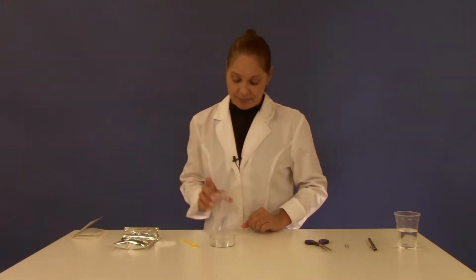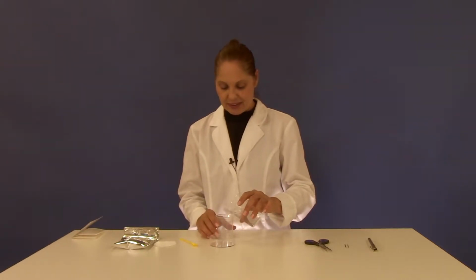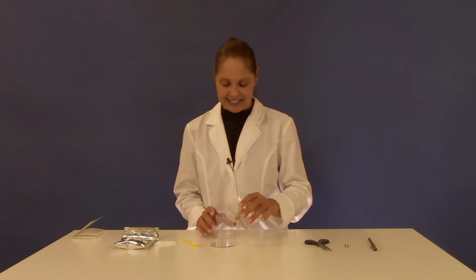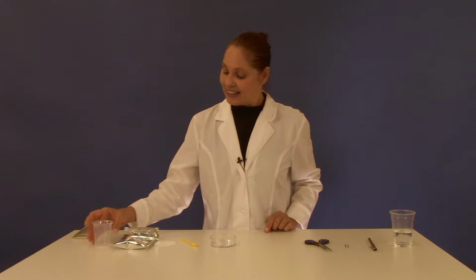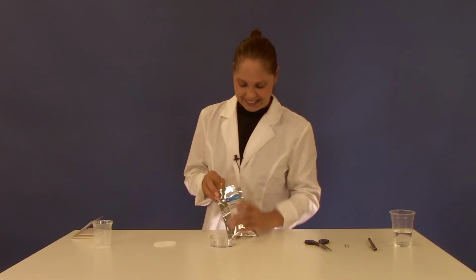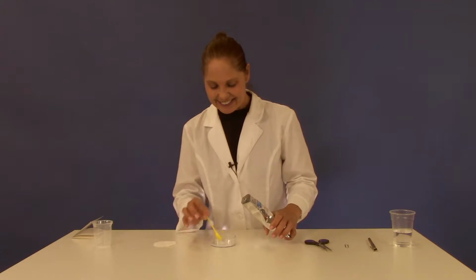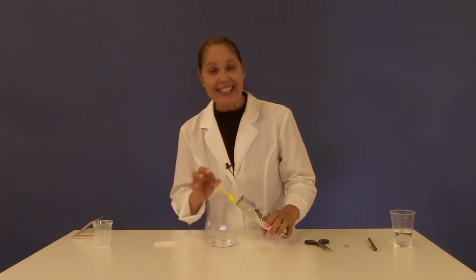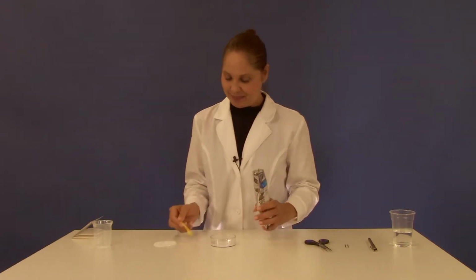Using your beaker, measure 15 milliliters of water into your petri dish. Now, add 5 large level spoonfuls of urea into the petri dish. 3, 4, and 5.